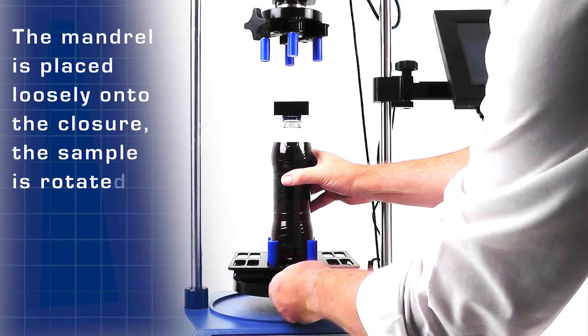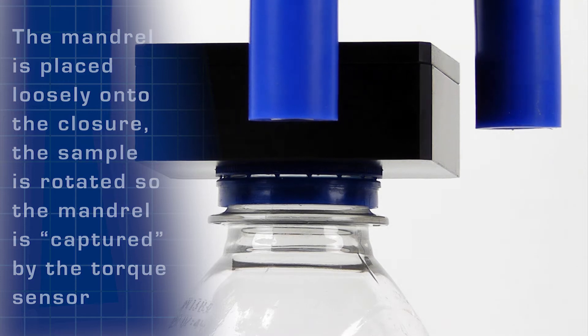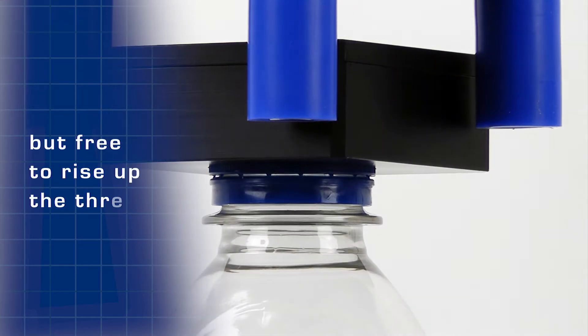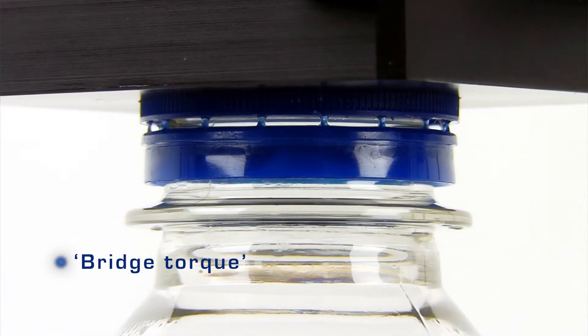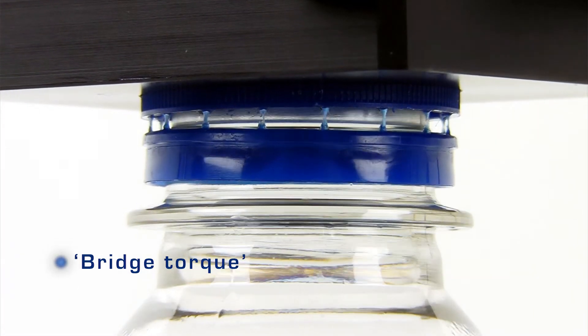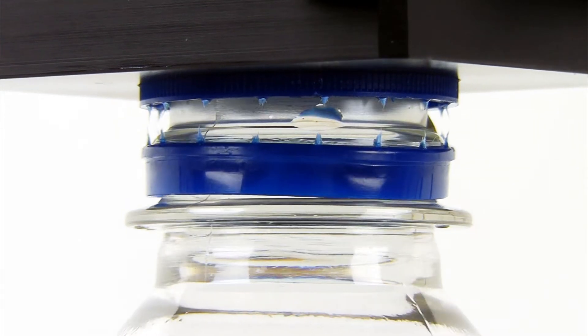With the mandrel placed loosely onto the closure, the sample is rotated so that the mandrel is captured by the torque sensor, but the closure is free to rise up the thread. By doing this, we also eliminate error that would otherwise be introduced from parasitic top loading.